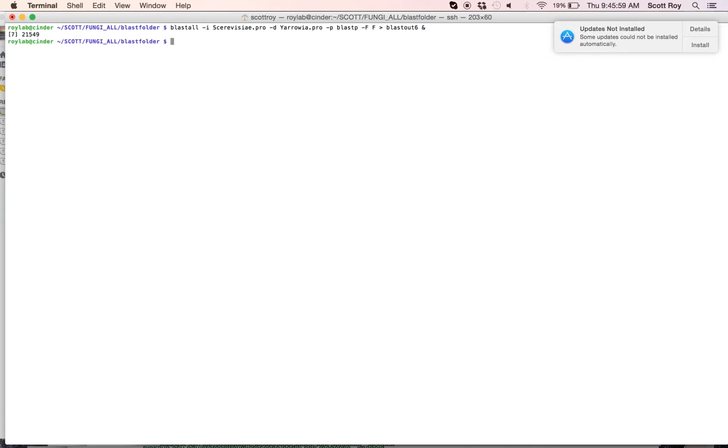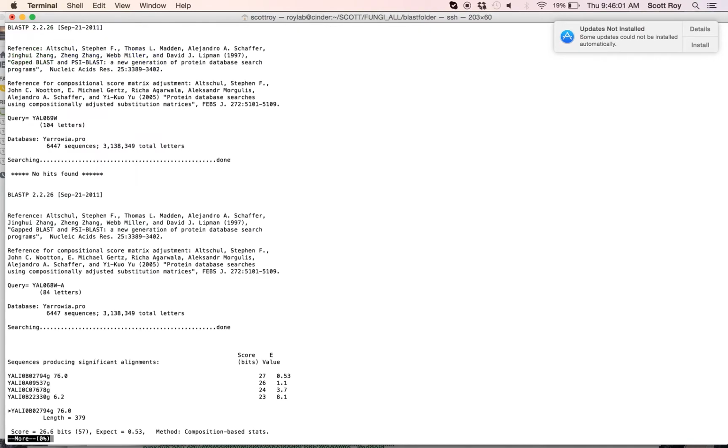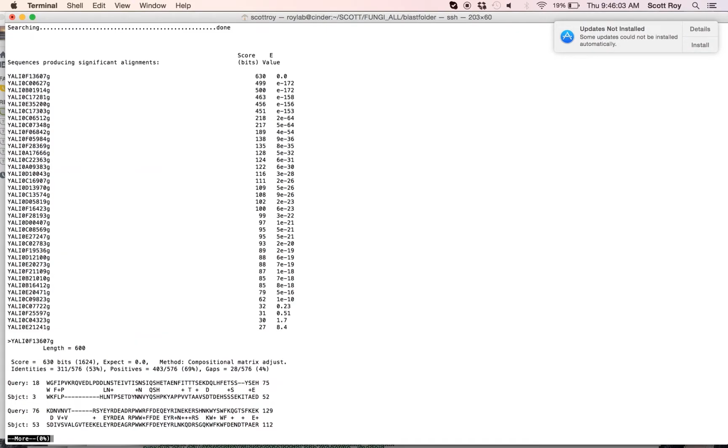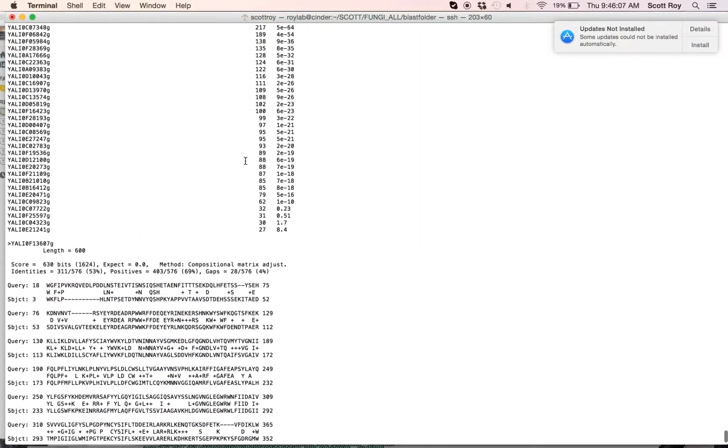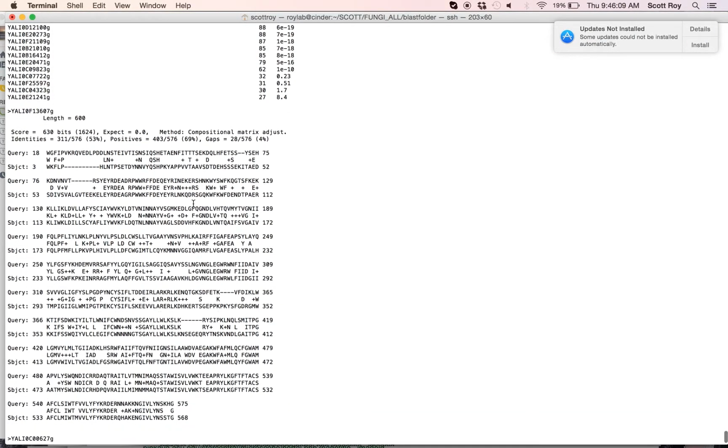And what that means is that, so it was here. I think it was around here that it had filtered out. But in any case, it was somewhere in this protein that was all X's, and now we can see that it does not have X's. It's actually used the entire input sequence.